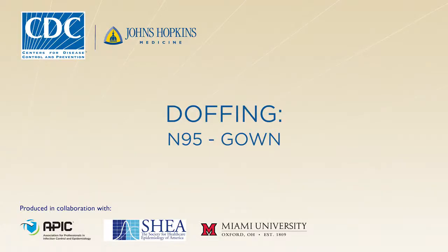In this video, you will learn how to doff or remove your personal protective equipment or PPE in accordance with CDC protocols. Following the doffing protocol will minimize the risk for disease transmission, so it's very important that you understand all the steps.